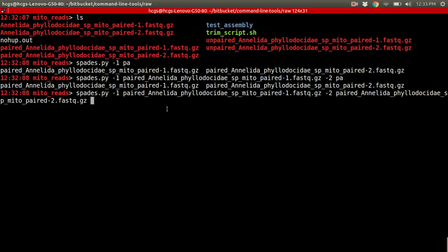It's also easier to keep track of Trimmomatic, because when you trim all those reads separately, you're going to have a bazillion files. So it's better just to concatenate them all and go through it in one go.